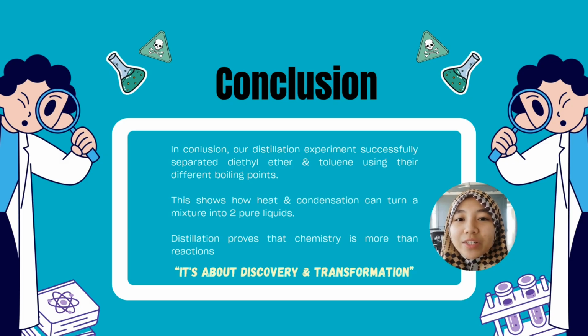In conclusion, our distillation experiment successfully separated diethyl ether and toluene using their different boiling points. This shows how heat and condensation can turn a mixture into two pure liquids. Distillation proved that chemistry is more than reaction. It's about discovery and transformation.